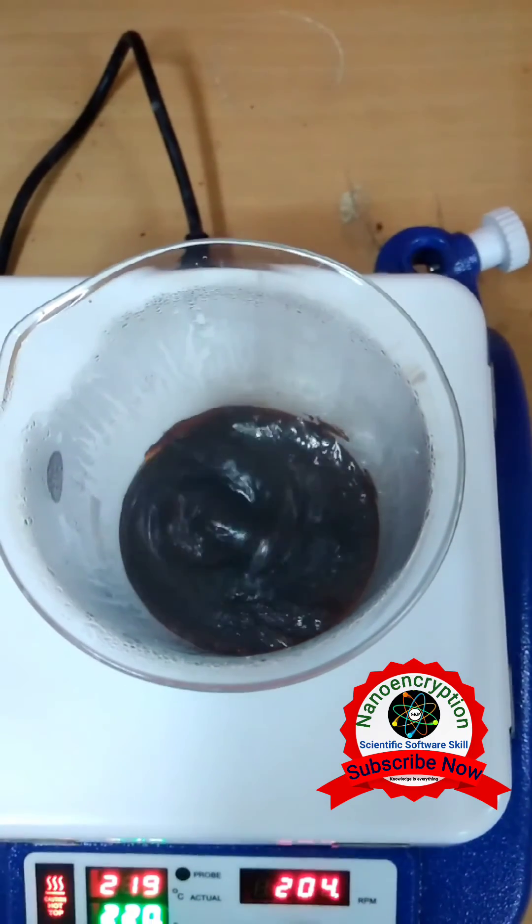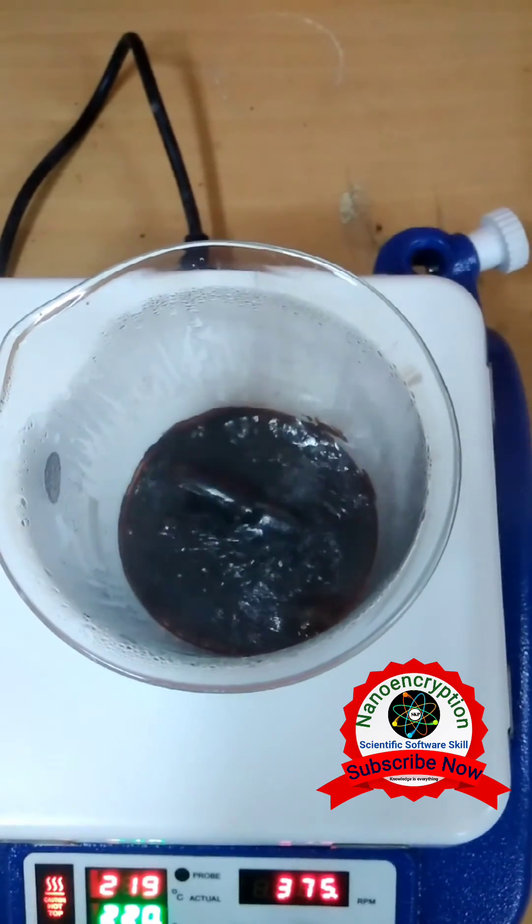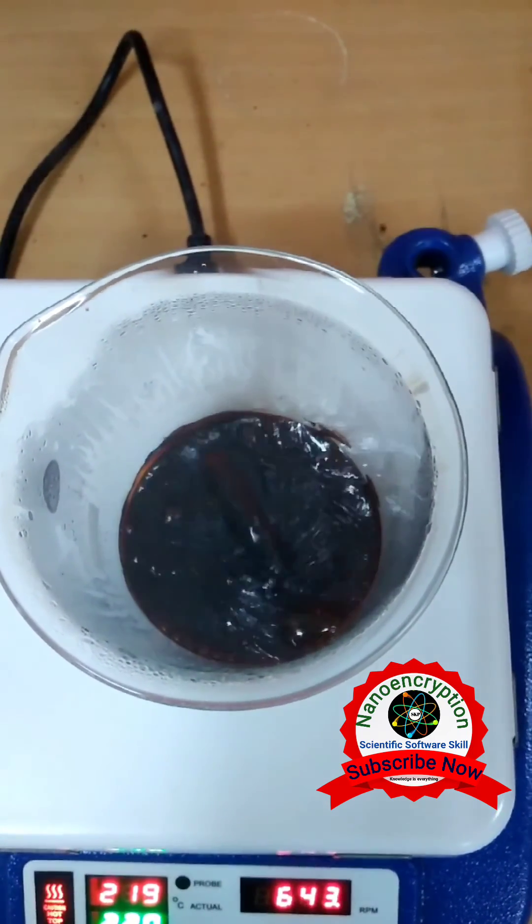Then after, grind it. Then after, we get the desired fine powder sample.